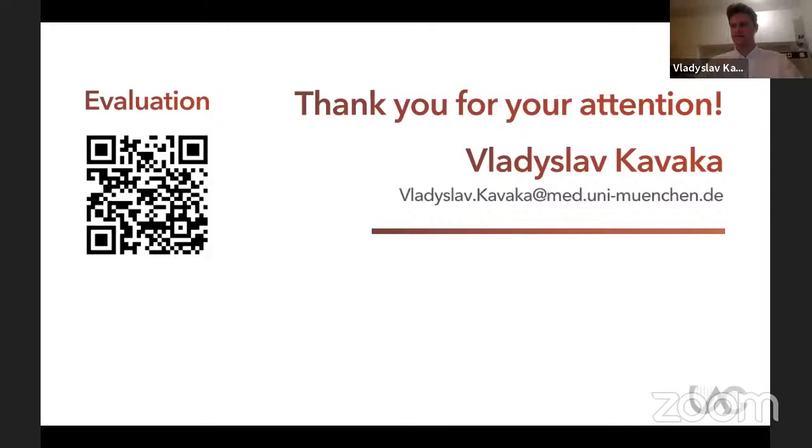Yeah. I will highlight it in my Friday session as well, like how to process already published datasets, because for some publications, the authors also developed a Shiny app or some kind of web tool to operate with this data, to discover expression profiles among different cells and other fancy features.